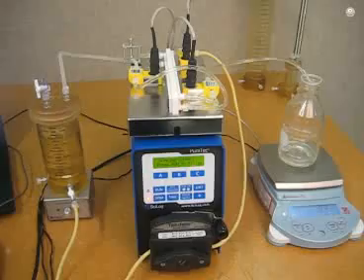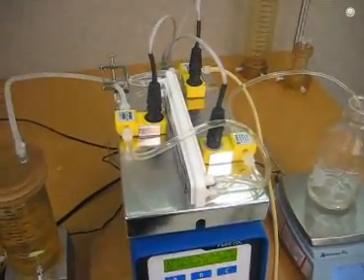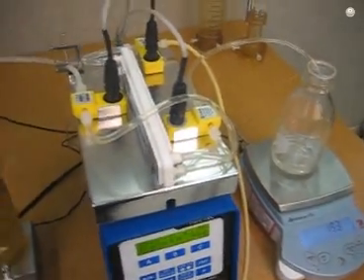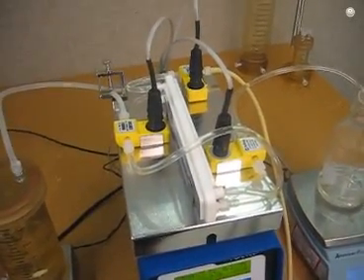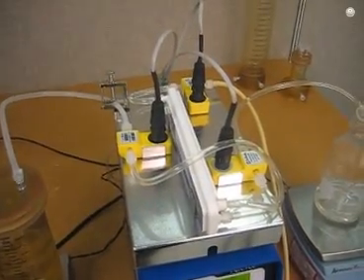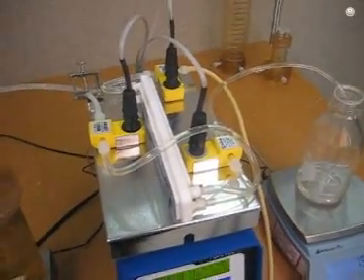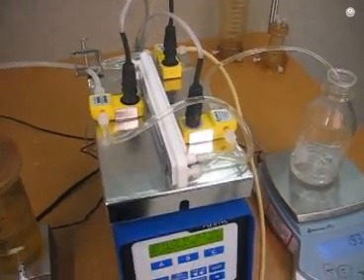With the manual system you'll typically be using analog pressure gauges. You don't have to do that anymore with the PureTech system because we have our patented single-use PSI press sensors. These sensors are pre-calibrated. They're single-use if you want them to be, otherwise you can clean them with sodium hydroxide, autoclave them, or gamma irradiate them. You don't have to write down the pressures because the pressures are automatically written to an Excel spreadsheet with the connected laptop. The data is written in this case every 30 seconds.